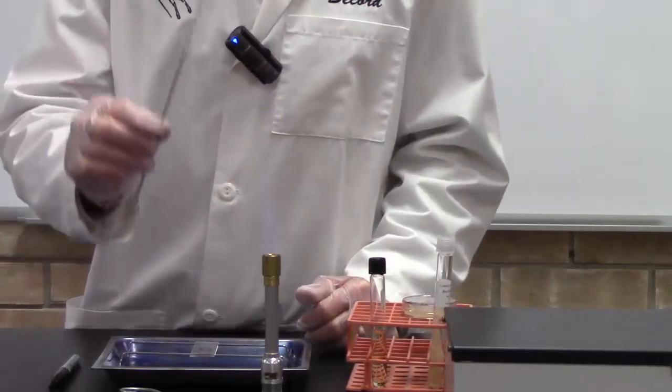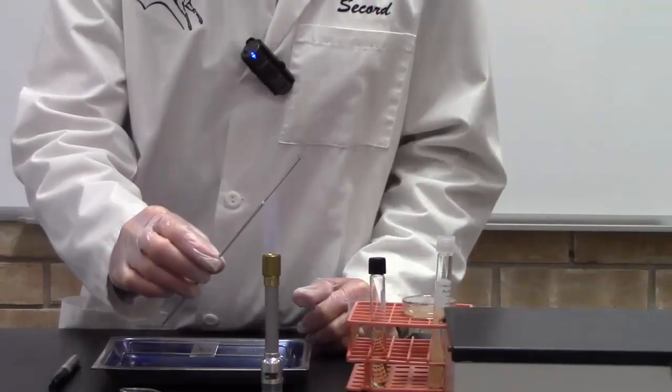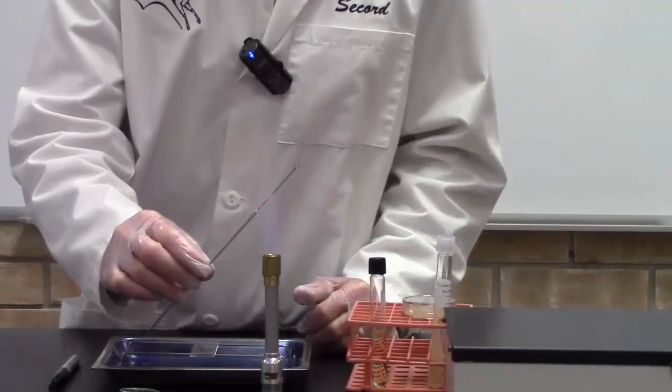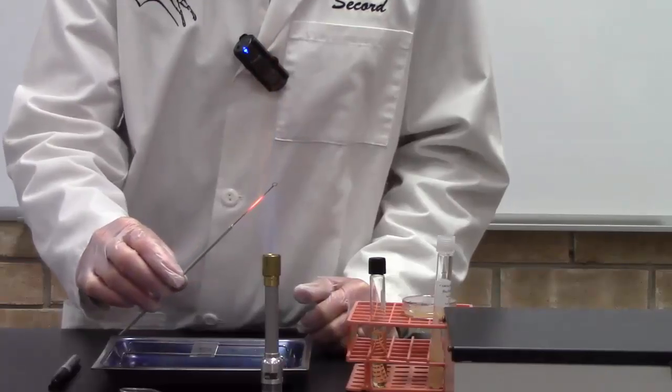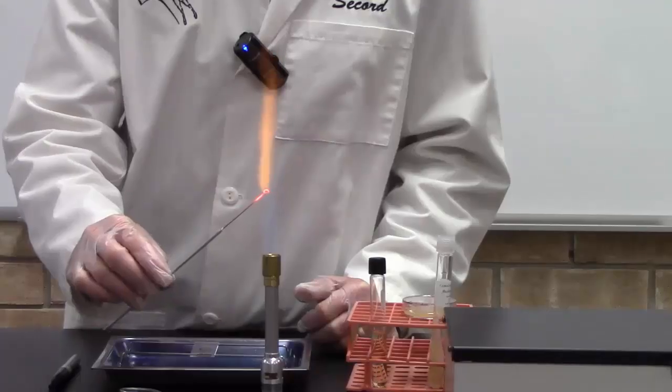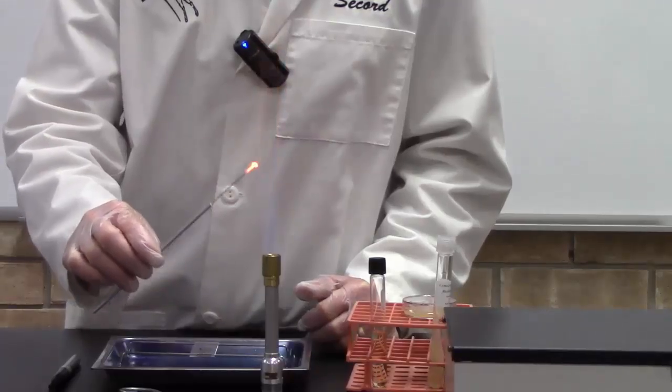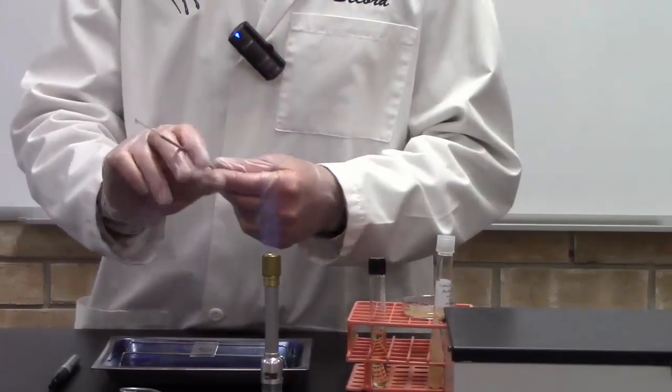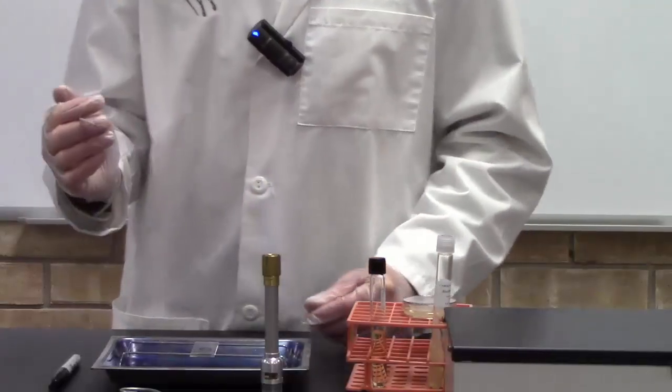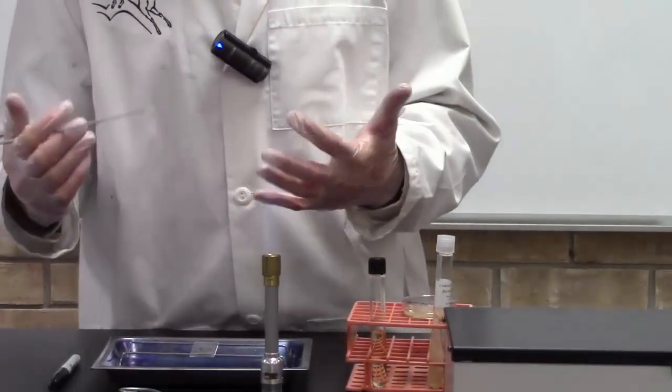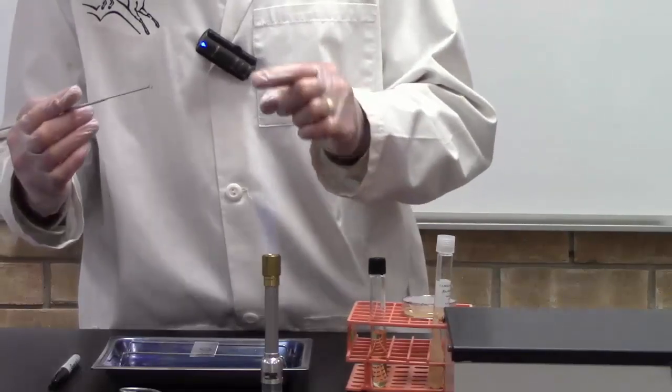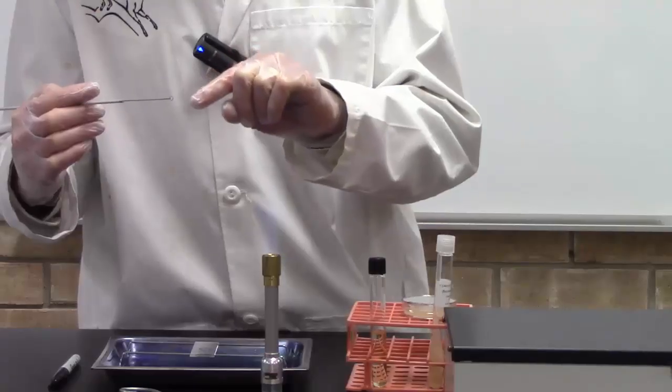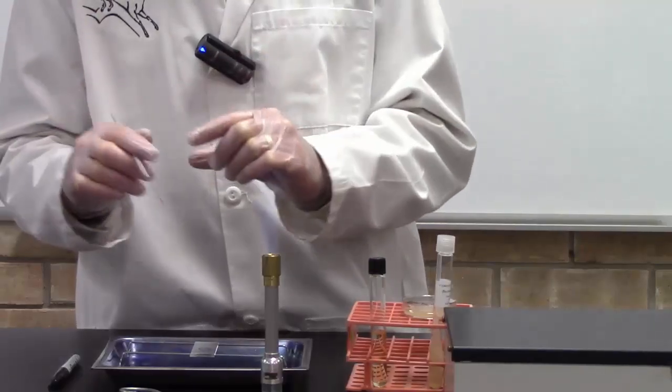Here's how you do it. Take your inoculating loop and sterilize it, so flame it. I start at the bottom of the loop and run it all the way through the tip. So I heat sterilize it, then I give it time to cool. Now through trial and error, I found out the perfect amount of water to use for bacterial smear is the amount of water that you can fit in the loop on the end of your inoculating loop.